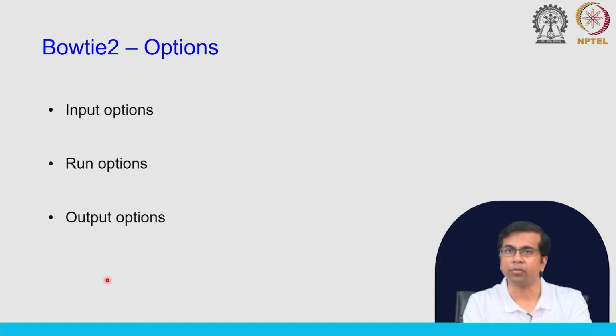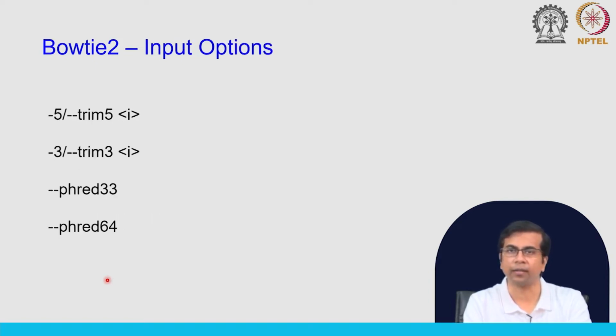So, what we are going to do, so I have introduced them in the last class or so. So, I will just summarize some of these, because what we will do today is we will also start with using them, right. So, I will show you how you actually use them and what kind of effect you will see on the data analysis.